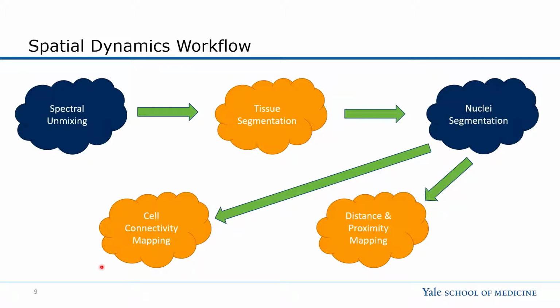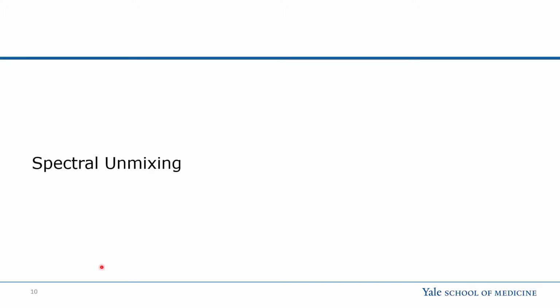It may give us clues as to how different therapeutic responses, in our case, are playing out based on the connections and their interactions. And so the cell connectivity itself is actually going to be very important. Although what I'm showing you in this presentation will be restricted to about 50 micron distances, we actually plan to do a few further studies where we're looking at cell-cell contacts, because that's going to be important as we look at how these different cell types within the microenvironment are interacting.